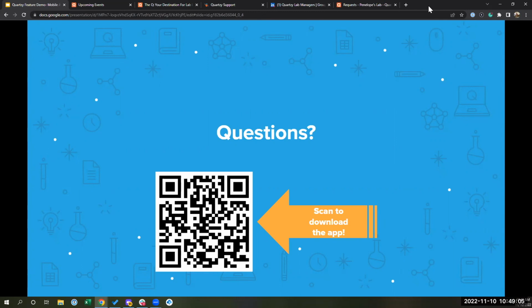That would definitely work. What I think Libby is referring to is another future concept that we have designs for, and we're working on kind of testing the concept. But the ability to scan a barcode, and when you don't have any results returned, add an interaction that lets you link that barcode. So okay, you just scanned Sigma's ethanol barcode and you didn't find anything, so then it prompts you to search. You find the item in your inventory, your request, and then there's a button that says link. And then that means in the future you could use that barcode going forward. That's again something we're looking at for next year. That's such an exciting feature.